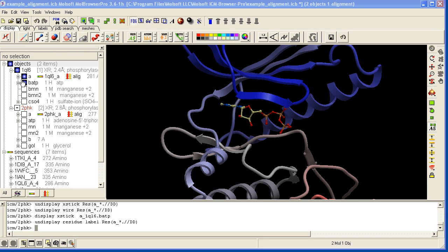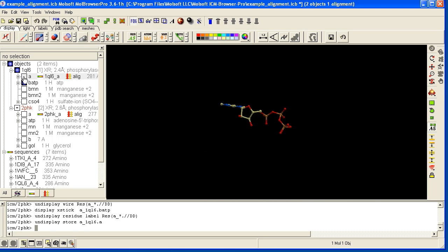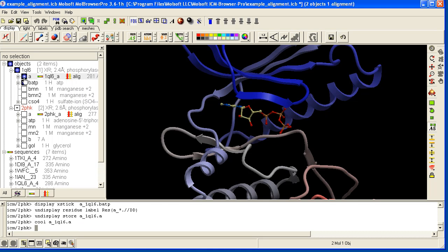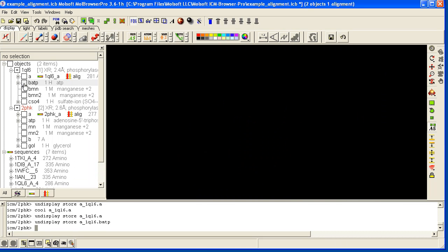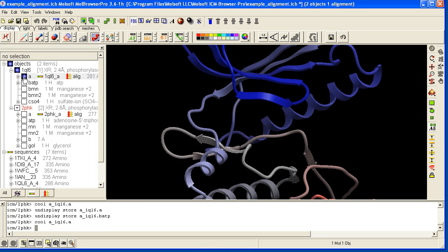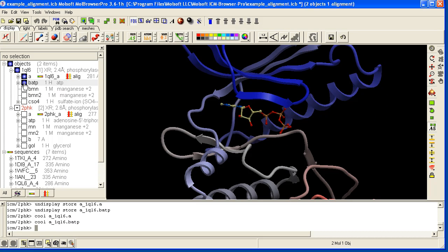You can undisplay and display by clicking in the boxes here. So here I'm displaying the A subunit and the B subunit.